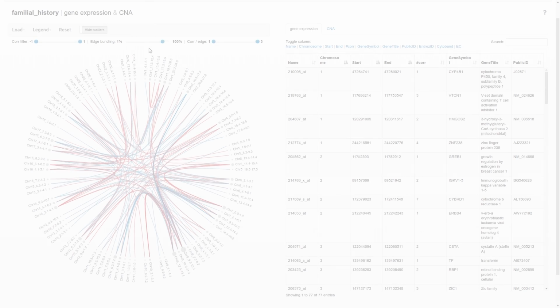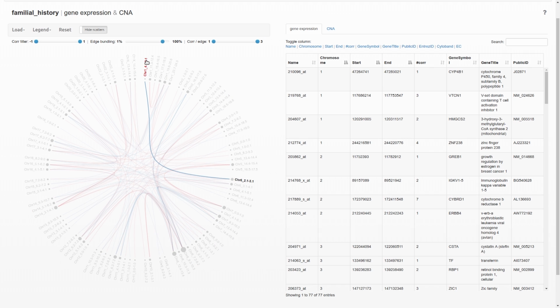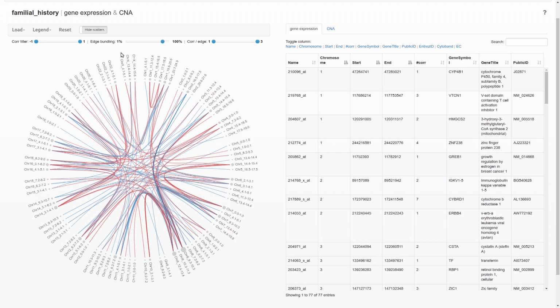On the left, we see a circular chromosomal map of the species the study was carried out on. Since this demonstration is based on the data from breast cancer patients, we see the human genome here laid out in a clockwise fashion. At 12 o'clock, we see the first chromosome, followed by the other autosomes, till we finally get to the X chromosome around 11:30. For visual clarity, CorrMapper bins all genomes into 300 buckets. In case of the human genome, each bucket corresponds to roughly 10,000 kilobases.